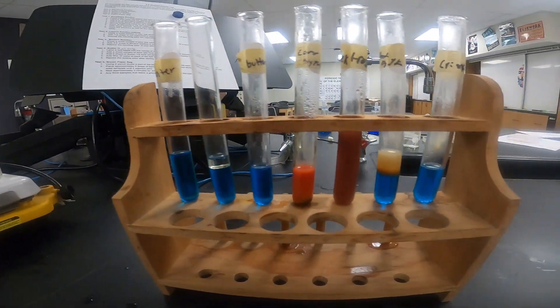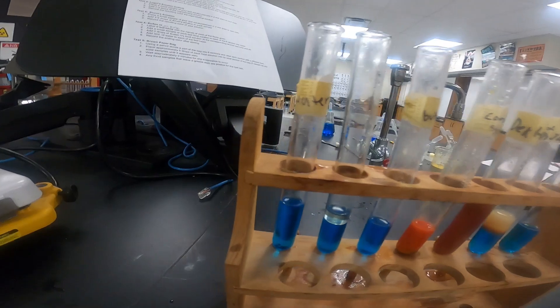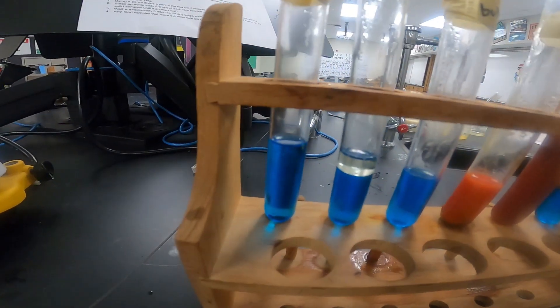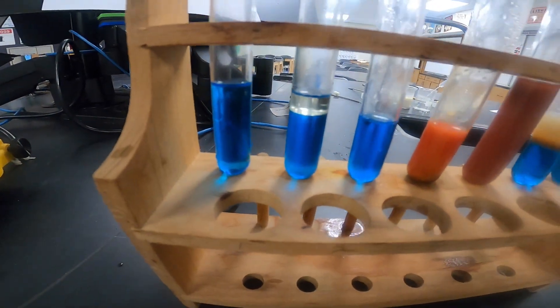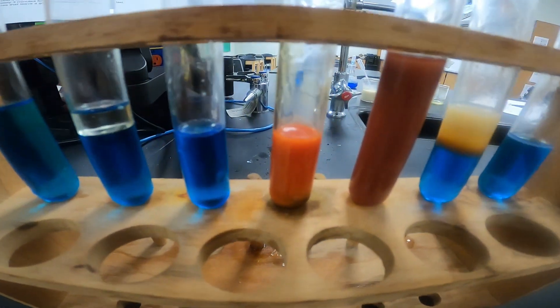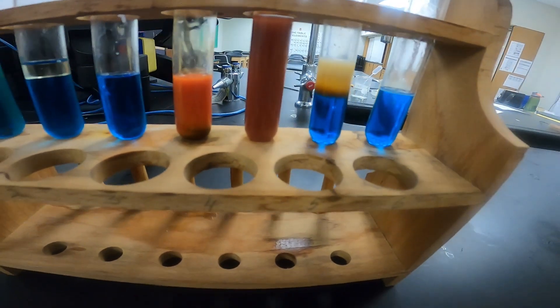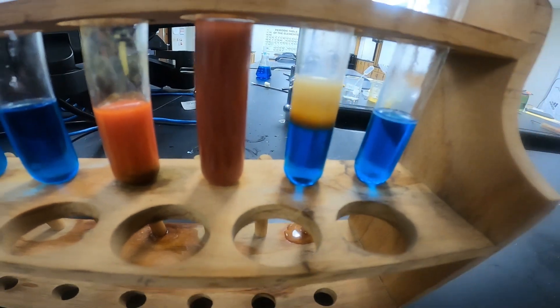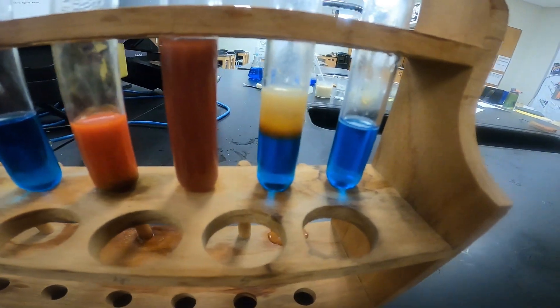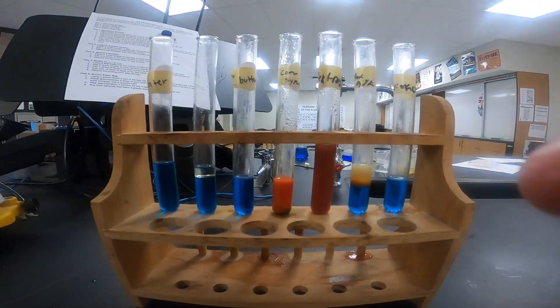Now that it's been about five minutes, we'll go ahead and remove our samples from the hot water bath. We can see we clearly have some color change. We'll let it cool for a couple minutes, but right now we can see the water's staying blue, our vegetable oil is also staying blue, our butter is still blue, our corn syrup has kind of a deep red color, our dextrose is a dark red — even almost purple. Our oatmeal has some orange color change at the top. We'll mix it up and see if that's throughout. And then Crisco stays blue as well.